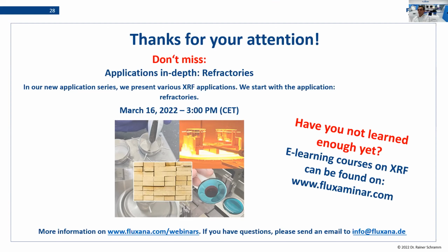How do you eliminate instrument uncertainty over the long term when evaluating CRM stability? This is a very good question. What we try to do is we have some reference material in our laboratory, which we know very well, and we always run them together with the candidate material we want to test.